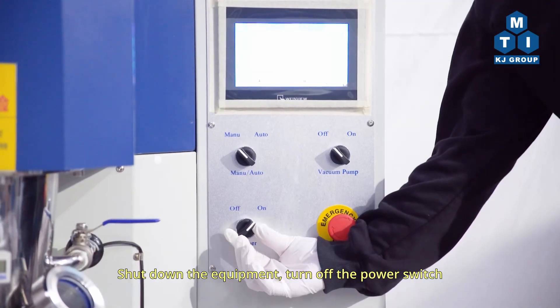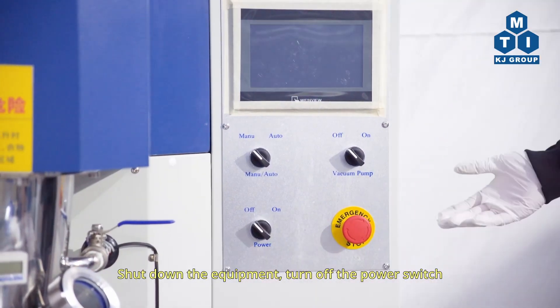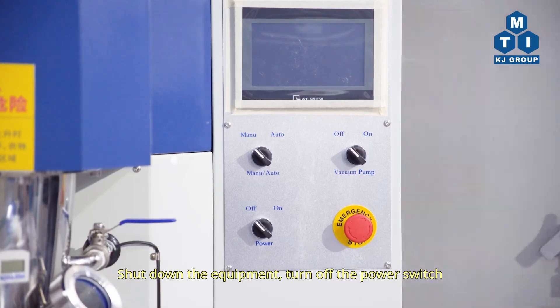Shut down the equipment and turn off the power switch. MTI — the leading provider of scientific equipment for material research.